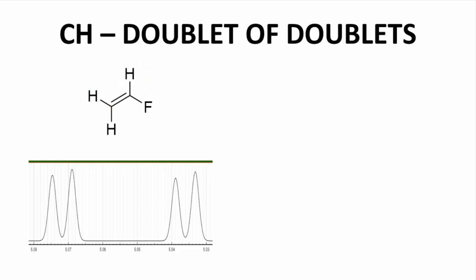Geminal hydrogens generally do not give J coupling interactions, but it sometimes happens, especially in alkenes. So this hydrogen, whichever it is, will have a J value for the CH on the right to give a doublet, and a smaller J value for the geminal coupling, JG, to give a doublet of doublets. What are the coupling constants? We'll measure them just like the previous slide showed.